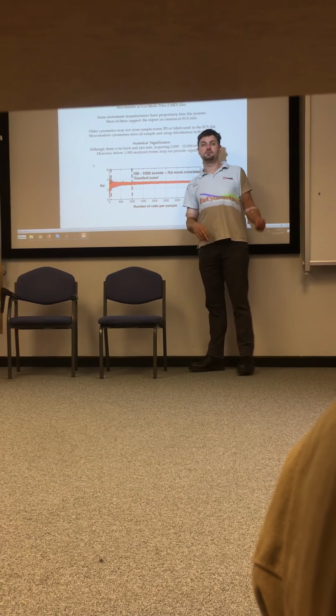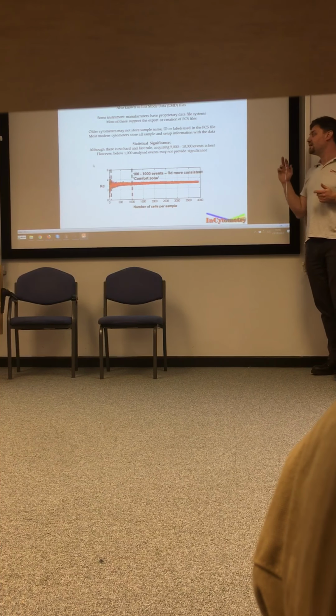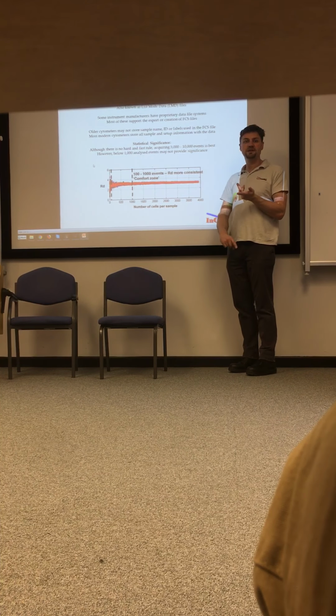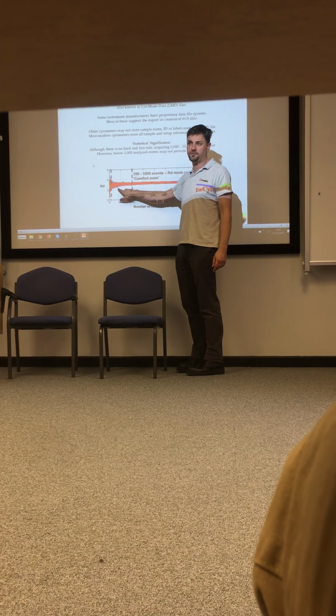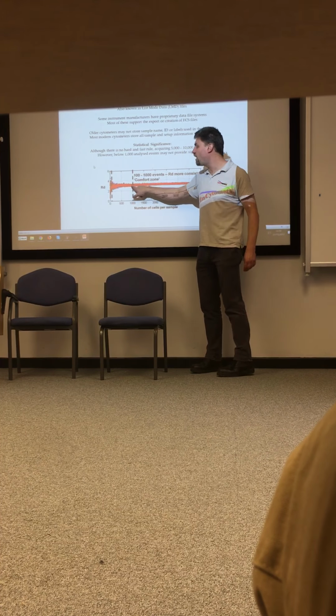So people say, well, why don't I just acquire 1,000 cells then? Why am I acquiring 10,000? Well, of course, once you get rid of debris, and doublets and aggregates and bits and pieces you don't need, if you only acquire 1,000, you're suddenly down here somewhere. It's not so good. And say, oh, all right, 2,000 then, because even if we lose half, it's still down.